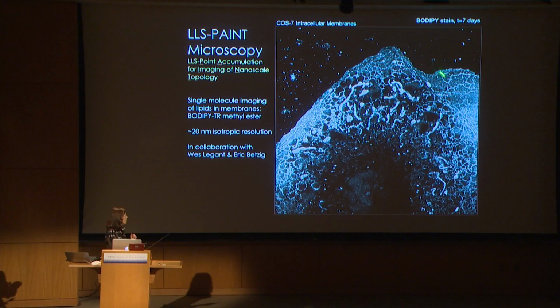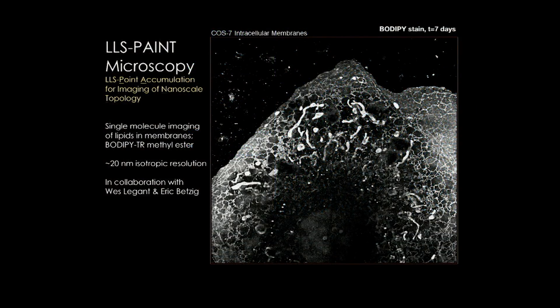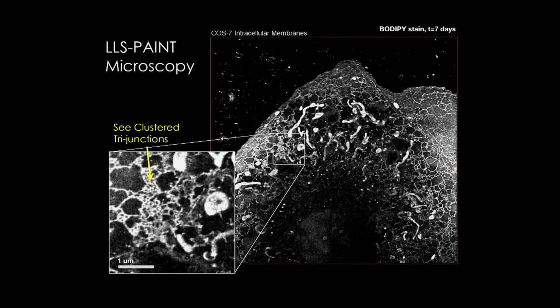Now that we have an image of all these organelles, and you can see mitochondria here, and this web-like structure represents the endoplasmic reticulum, we can now come in and dock in particular proteins of interest. I'm just going to zoom in on this area here because what we were particularly interested in this study was how proteins that are part of the endoplasmic reticulum, which is this large structure that expands throughout the cytoplasm as this tubular meshwork, how it's organized.